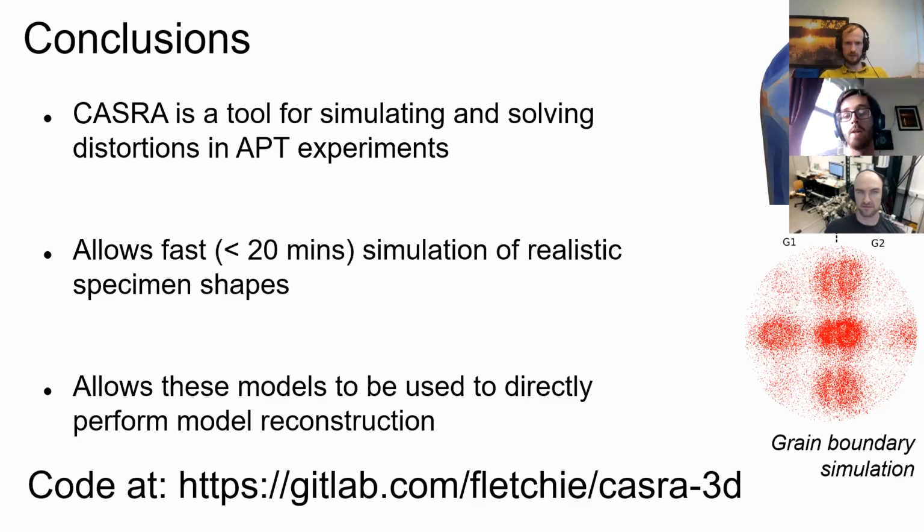Can you model voids? Yes, you can. The method of simulation uses something called the level set method, and this allows you to track or model the joining and separating of curves or surfaces. So yes, this allows you to model voids. And actually, I've got a paper that's in press. I think it should be coming out sometime in the next 24 hours, at least the accepted manuscript, which talks a bit about modeling voids using CASRA. But yeah, that is definitely something you can do.